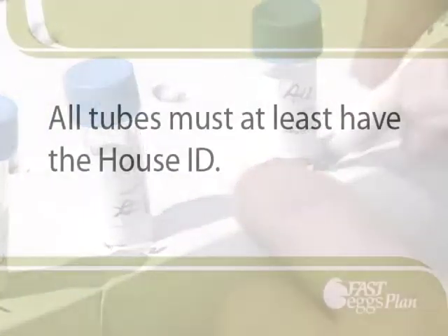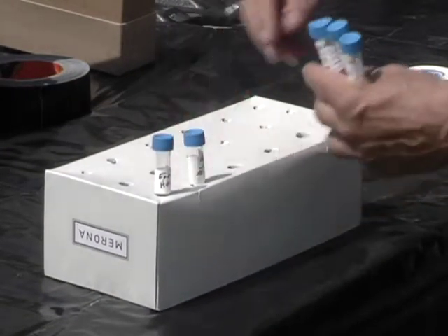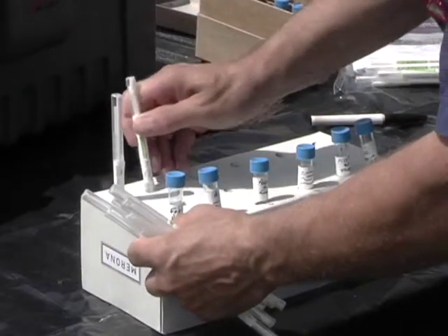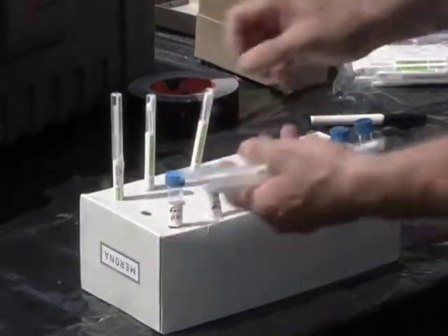The BHI broth tubes must also be labeled. Place the labeled BHI broth tubes in the first row of the holder. Put Dacron swabs in the third row. You need five Dacron swabs per house.